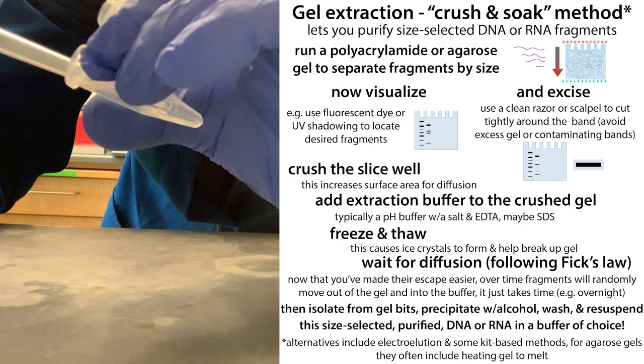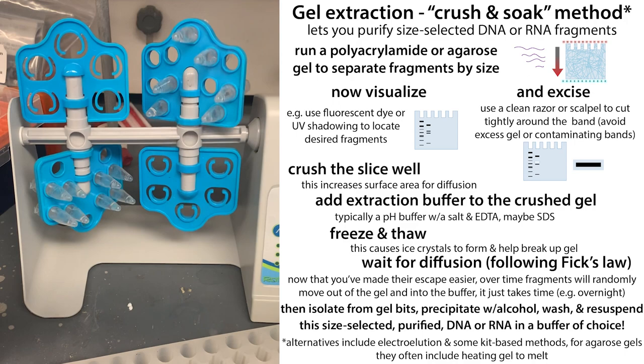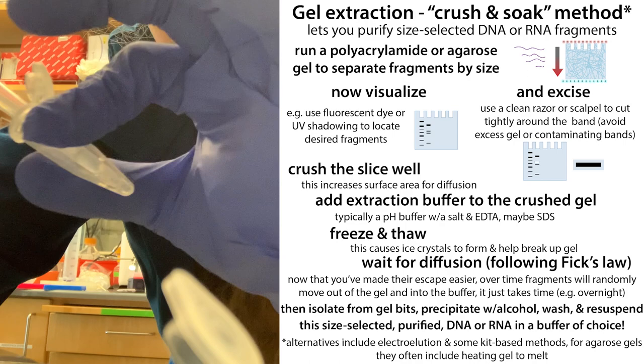What you're going to do is crush up that gel, then add extraction buffer — a liquid that provides a place for the nucleic acids to diffuse out of the gel so you can isolate them. I've talked about the theory of this in the past; today I want to tell you more about how we do it in practice and show you a demo.